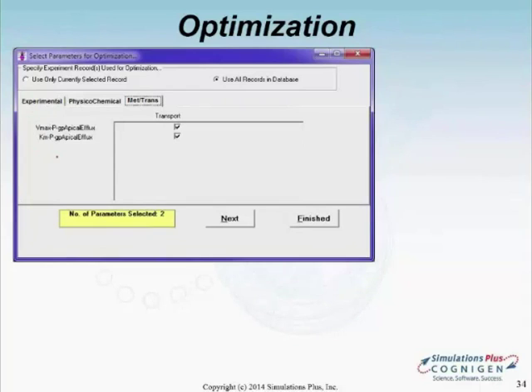If you are trying to achieve a certain outcome, you can figure out what your experimental conditions should be, even though what I personally expect is that most of your optimizations would be targeted towards fitting your transporter parameters, especially for the efflux transporters, fitting the Km and Vmax values, especially getting that Km value, which is based on the intracellular unbound concentration, for more direct translation to in vivo conditions.